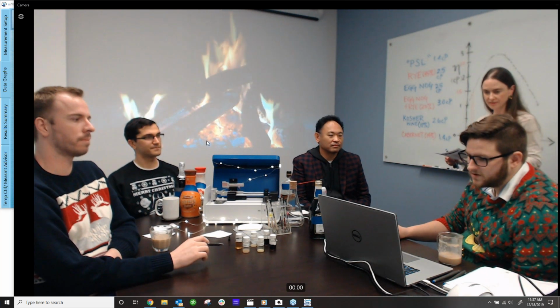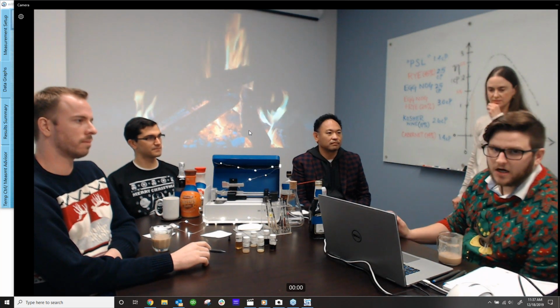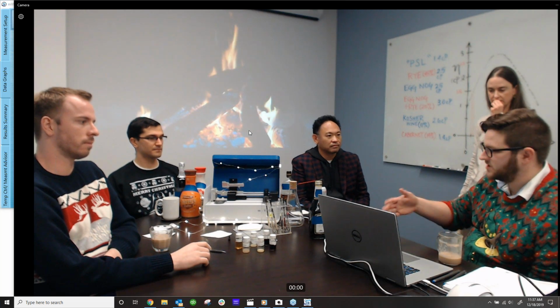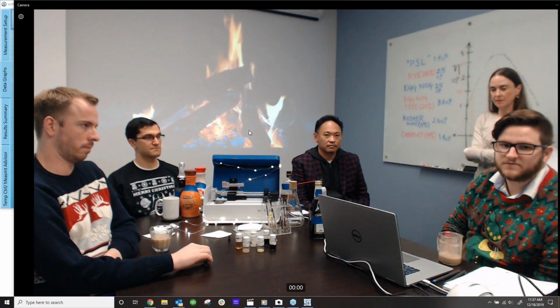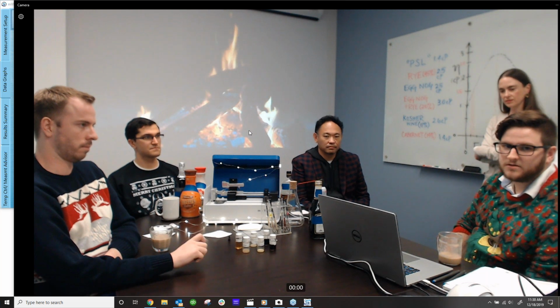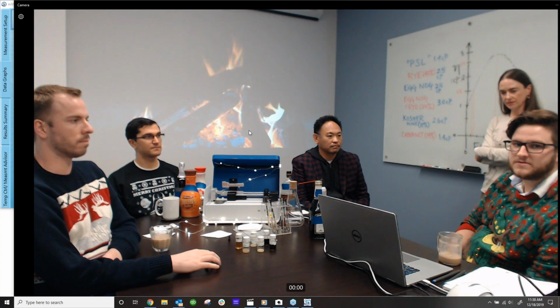Another question we had was, how can you use viscosity values of wine in a QC environment? A good way is you can always test viscosity of your sample as it goes through different processes. If the value is not consistent batch to batch, you can tell if there's any differences. Again, if there was the incorrect amount of sugar that you wanted, or the incorrect amount of alcohol percentage, this can all be indicated by measuring viscosity.